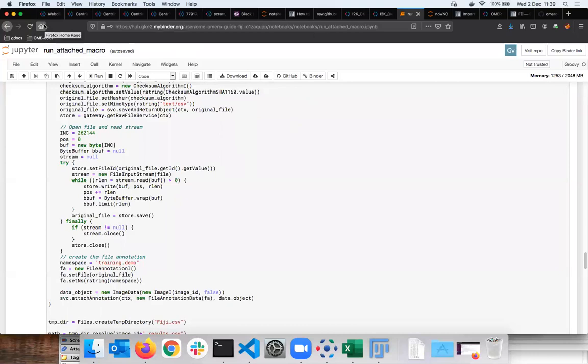After the break, we will show how you can mine the data based on the analysis results which we just created in Fiji or CellProfiler. We might or might not show QuPath, but definitely we will show OMERO.figure, and then we can go in depth into the OMERO in-place import and show the web tagging as well. This would be coming back to Sylvia's question from the beginning.